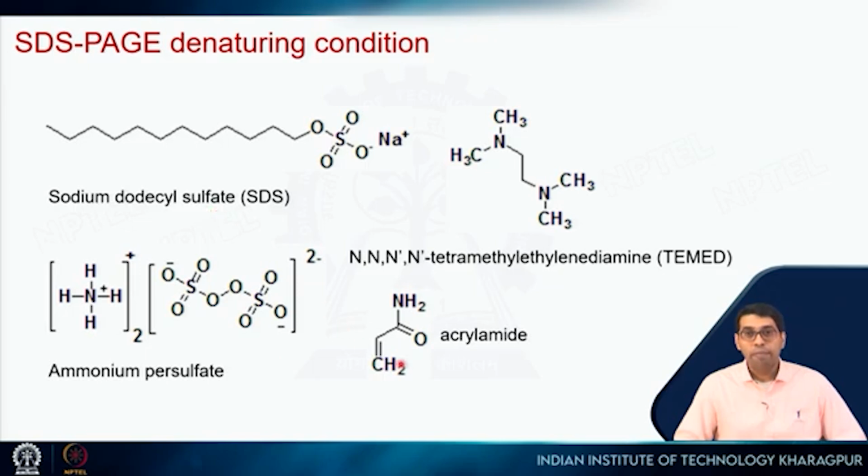You have already seen acrylamide and bisacrylamide, which form the polymer. However, the polymerization reaction is a free radical reaction, and this free radical is supplied by ammonium persulfate, right. It breaks and forms a free radical. However, ammonium persulfate cannot transfer this free radical very efficiently, so we need something called an initiator. This is N,N,N',N'-tetramethylethylenediamine, TEMED. There are 4 methyl groups, ethylene diamine, right.